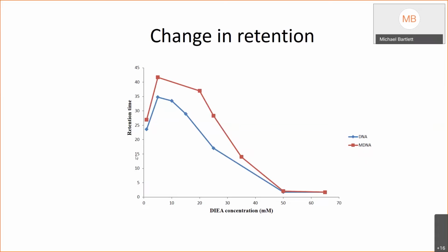And I said, well, that's a serious problem, because this is supposed to be ion pair chromatography, and that's not the way ion pair chromatography works. Ion pair chromatography works by increasing the ion pair, and we get more retention up until the point at which, at some point in time, maybe your counter ion starts repulsing it, and you'll get a little bit of rollover at really high concentration, but not like goes into your void volume problems here.